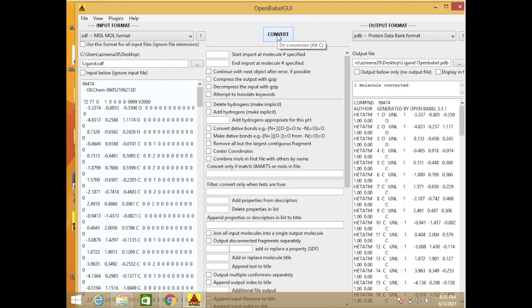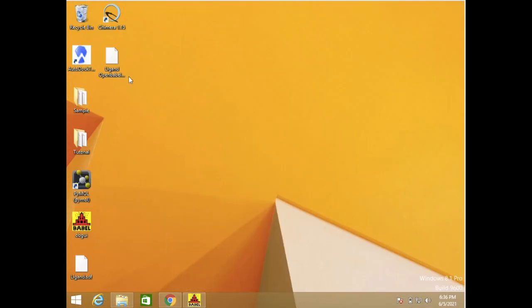Okay, so our file is already converted. This is the data. So look at our desktop. This is our ligand that we already converted into PDB. Easy, right?